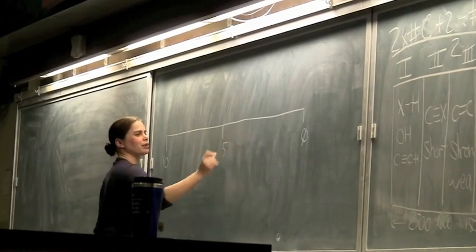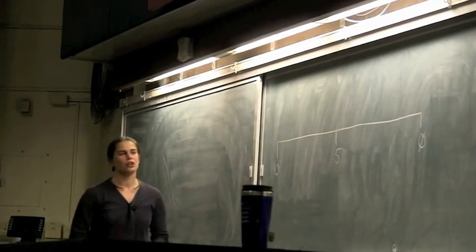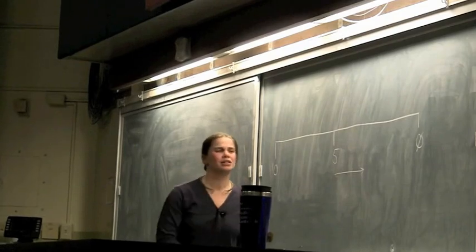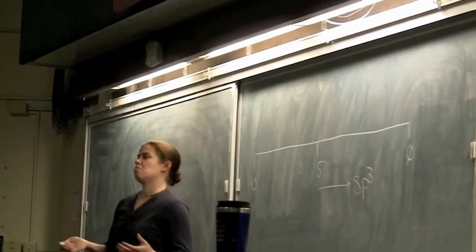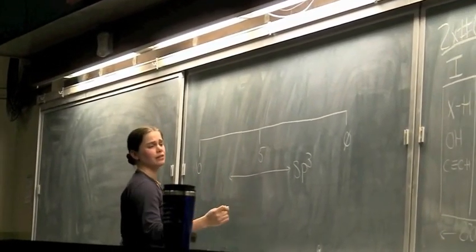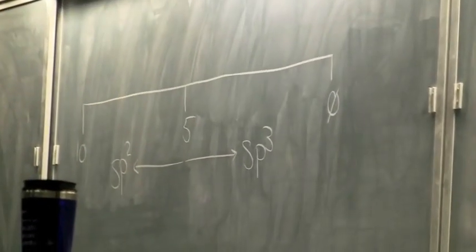And the thing that they never really tell you, but you start to notice if you spend your time staring at spectra for a while, is that everything on the right half of that, or most everything, tends to be sp3 hybridized. Pretty much everything on the left half of that spectrum, left of the 5, tends to be sp2 hybridized. I mean, sure, there's a couple of exceptions.